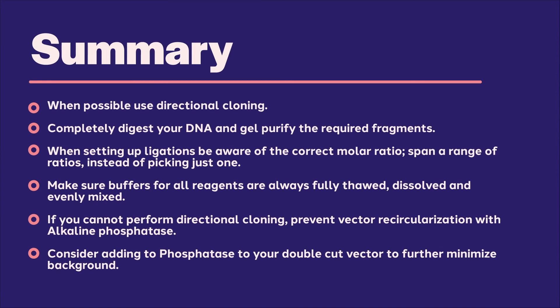Let's summarize the key tips to keep in mind when using restriction enzymes for cloning. 1. When possible, use directional cloning. 2. Set your restriction digest so that the DNA is cut to completion, then eliminate extra restriction enzymes or insignificant fragments by gel purification of your digested DNA. 3. When setting up ligations, be aware of the correct molar ratio and span a range of ratios instead of picking just one. 4. Make sure all buffers are fully thawed, dissolved, and evenly mixed. 5. If you cannot perform directional cloning, prevent vector recircularization with alkaline phosphatase. 6. Consider adding alkaline phosphatase to your double-cut vector to further minimize background, particularly if one or both of your enzymes is not 100% efficient.